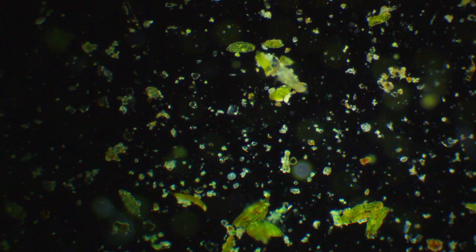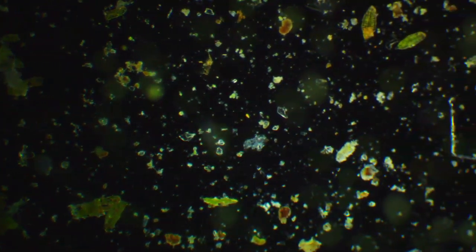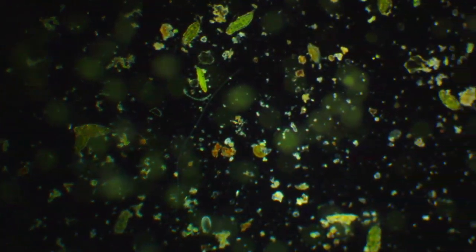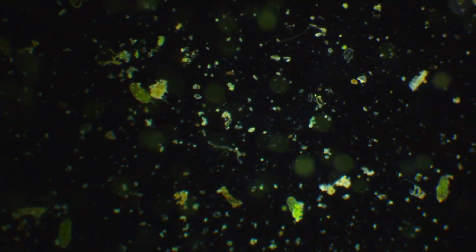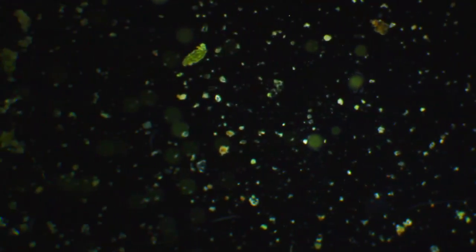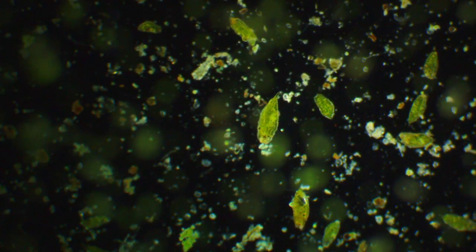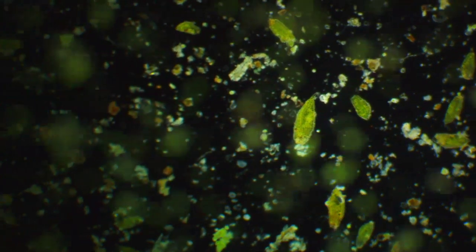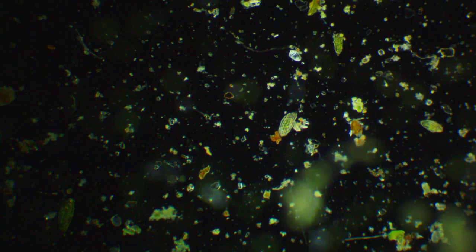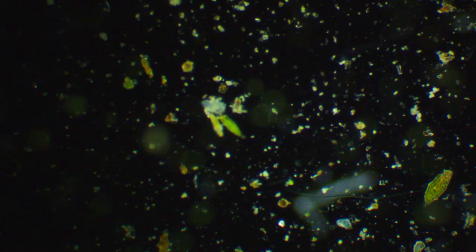So yeah, this rotifer at the top of the screen here is really big. And there's a little bitty rotifer right in the middle. Let's see what else is in here. More rotifers. Going down. More rotifers.